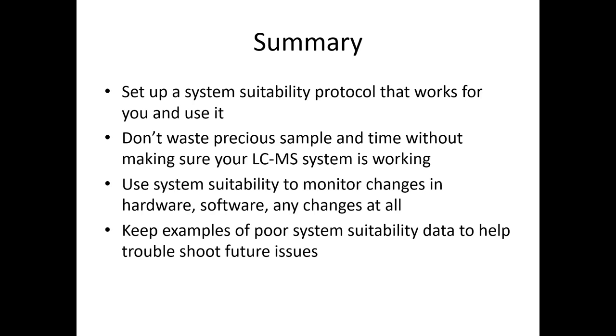Use the system suitability to monitor changes in hardware, software, any changes at all. We used it a lot during some construction that was going on in our lab. Were you there during that time, Lindsay, when they put up the new building? There was dust everywhere. And in one of the labs with the triple quads, we saw an increase in the baseline and it just kept going up and up. It was because the cover on the electrometer of the triple quad wasn't secured.